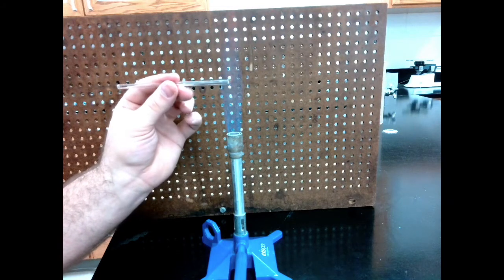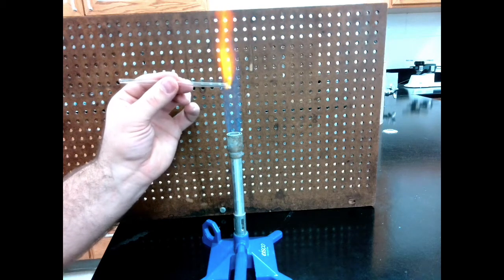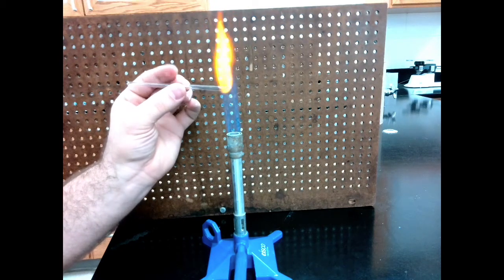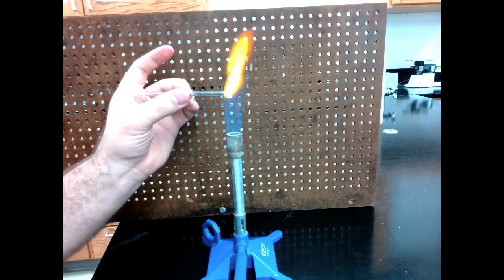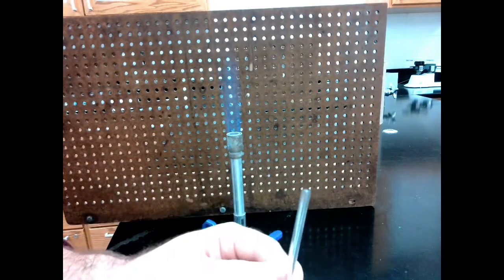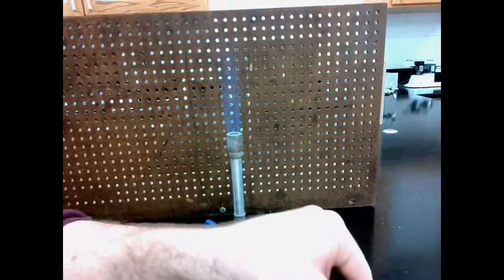So once again, I'm just rotating it back and forth. And now I've got both sides nice and smooth. Those will be able to fit into a cork. Now I'm going to give this time to cool down so that I can melt the middle of this glass tube and allow it to bend. And then we'll look at that.